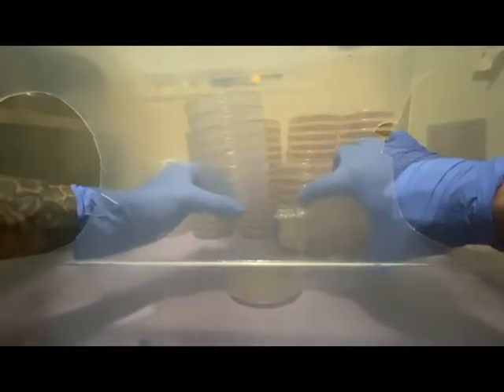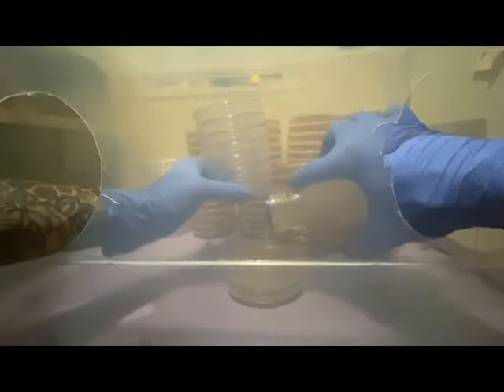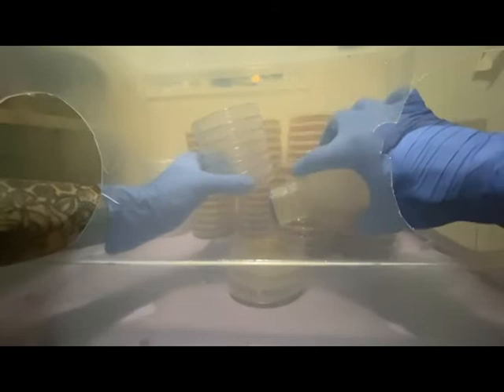Sure, we're working within a sterile environment. But it's not 100% sterile, you know, it's sterile to the best of our abilities. The longer the lid of this media bottle stays open, that's more opportunity for bacteria and competing molds and funguses, and yeast, to swoop in and contaminate your media.